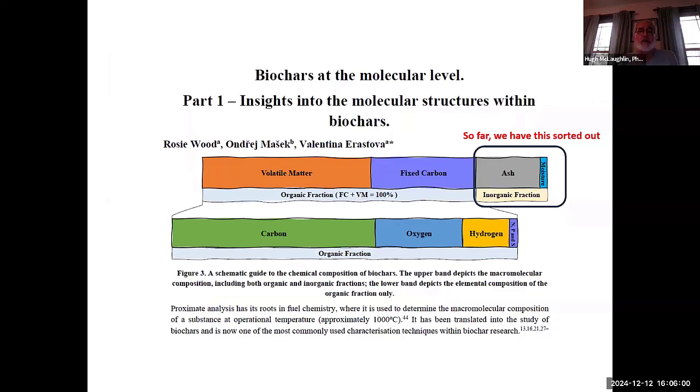And the good news and the bad news: we've really only characterized that little right-hand piece. We don't have, and here's where they're using the old names, fixed carbon and volatile matter, which come from coal characterization. And we're going to take a stab at trying to pull those two groups apart. This particular piece of work is the finest piece of work that's out there so far, out of the UK, out of Christian's group. These are his colleagues, and it's really to be admired.